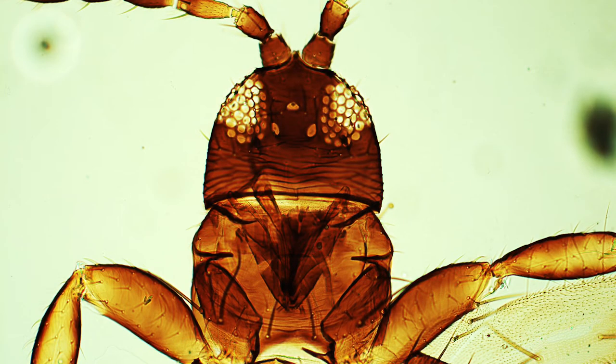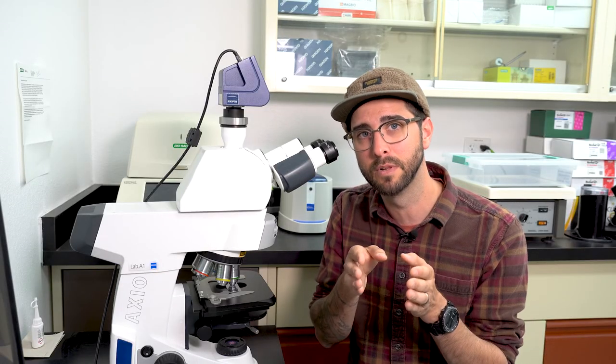I've got the compound microscope set to 200 times magnification. First, let's take a look at the thrips head — this is where the feeding mouthparts are. Here you can see this mouth cone, where the piercing-sucking mouthparts are on the front of the face. This is where they're going to be sticking into the plant to feed, piercing the plant tissue and causing their damage.